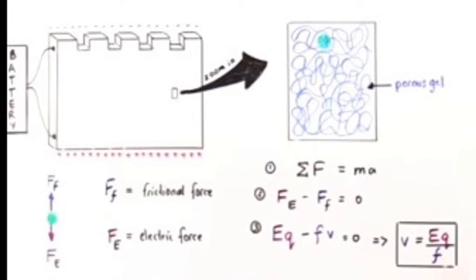As you can see, downwards here these are positively charged, and on top here, negatively charged. We've connected the power source, which gives the electric field to the slab, in such a way that on top it will be negatively charged and at the bottom it will be positively charged.